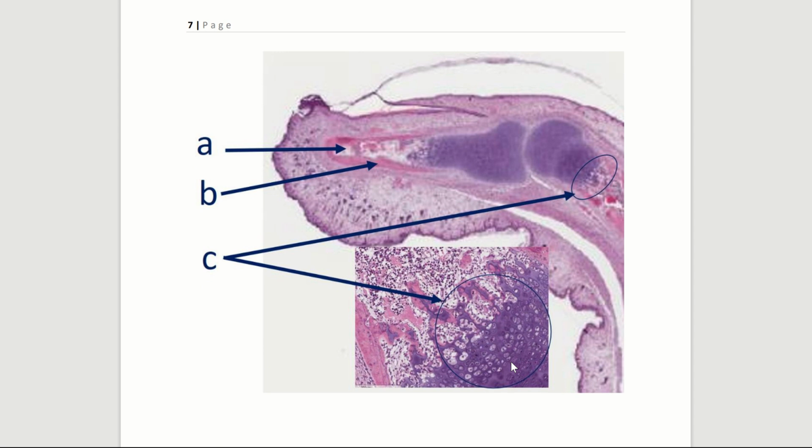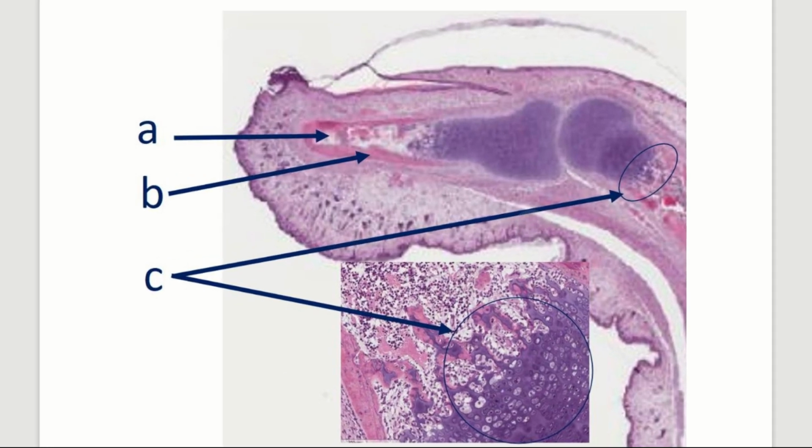Okay, this next one, so we're looking at a fetal finger, right? So this is a fetal finger, and this is what I've been telling you guys about, how hyaline cartilage is the blueprint to bone, right? They haven't been born yet, so not all of this cartilage has been turned into bone. The vast majority of it is actually cartilage right here, right? And then we've got our endochondral ossification occurring right here.